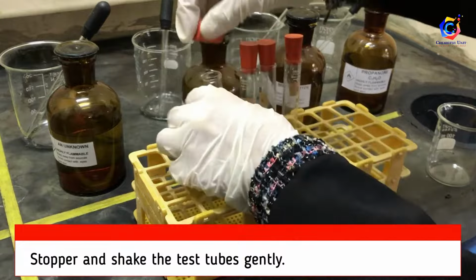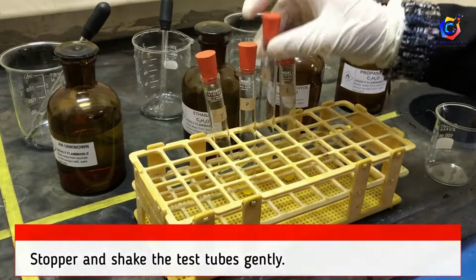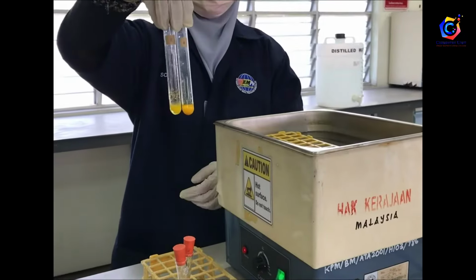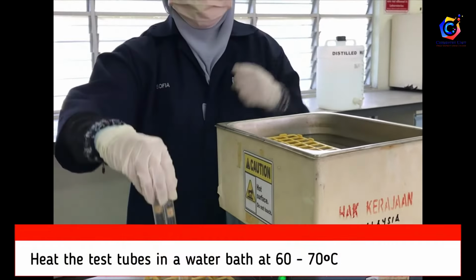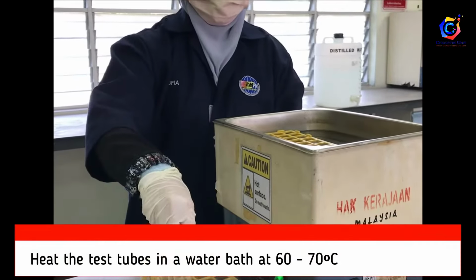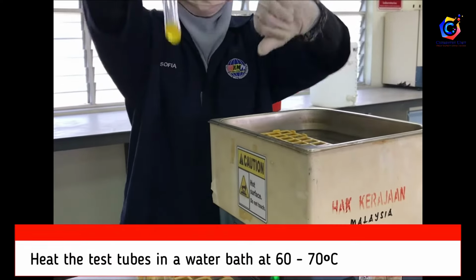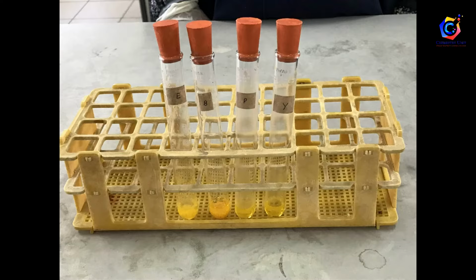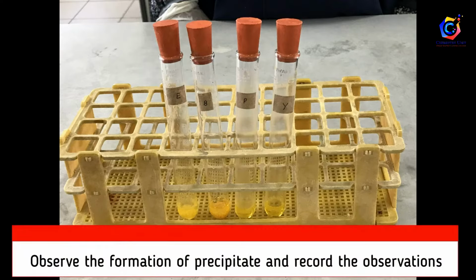Stopper and shake the test tubes gently. If there's no precipitate, heat the test tubes in the water bath with a temperature within 60 to 70 degrees Celsius. Observe the formation of precipitate and record the observations.